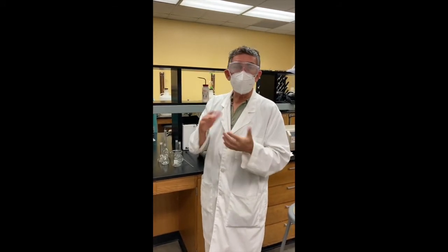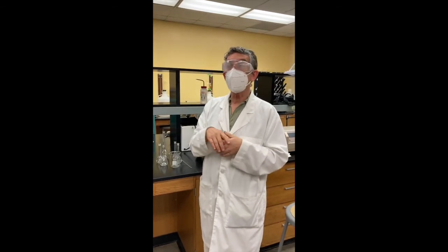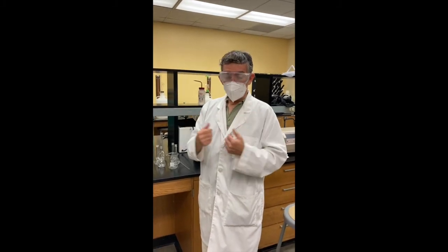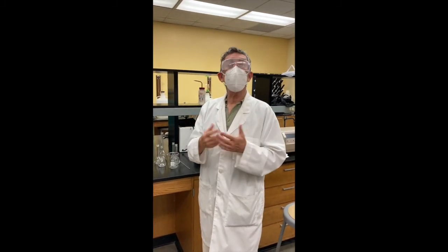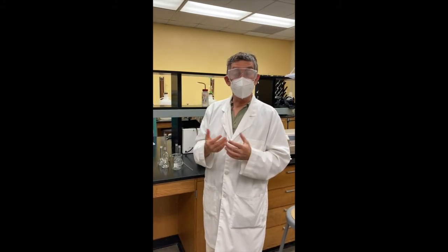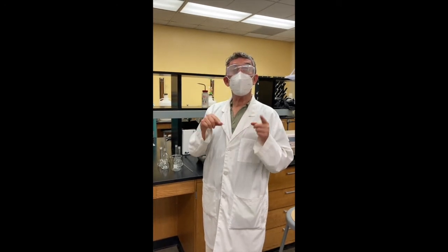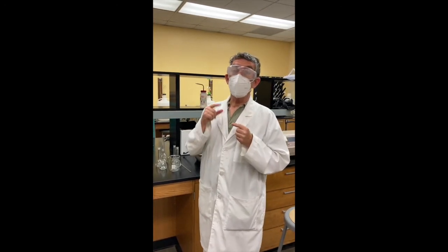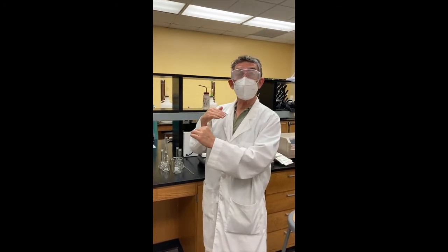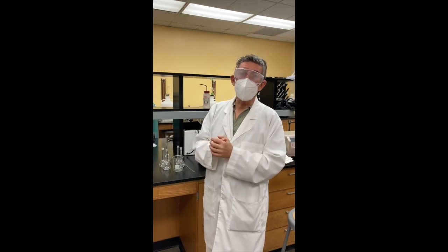For example, water is not very viscous, and hexane is less viscous yet. So we're going to measure the viscosity, and there are some theoretical equations that will relate the viscosity to the molecular weight. One thing though, the viscosity is dependent on concentration. So to really get at the molecular weight, you have to take several measurements at different concentrations, extrapolate to zero concentration, and there you go.